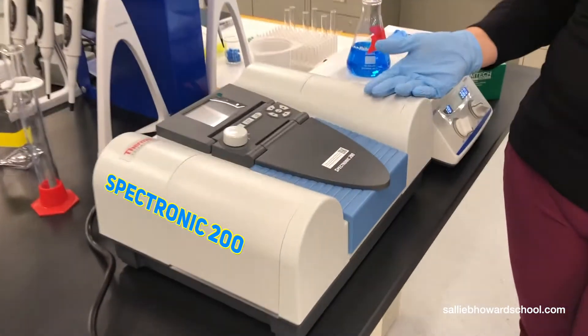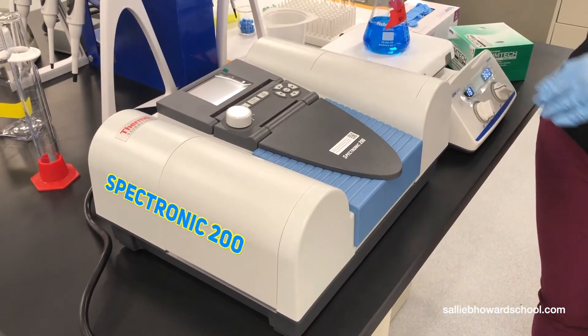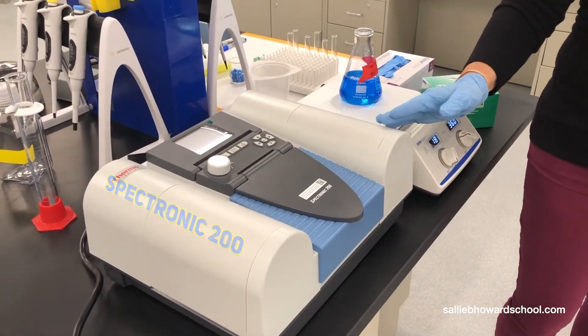This is a Spectronic 200. Every student has one of these at their lab space, and this is for when they dilute these solutions and then want to quantify the result. They will use this instrument.